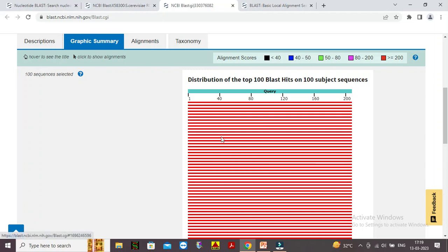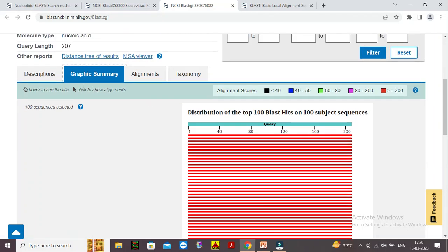So for today, these are the results, and that is all for this video. We will discuss the description results, alignment and taxonomy in another video.